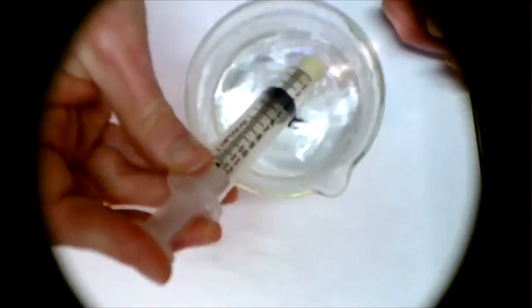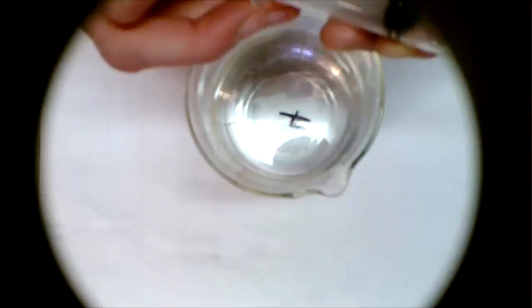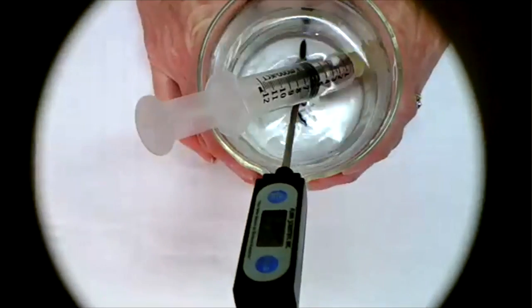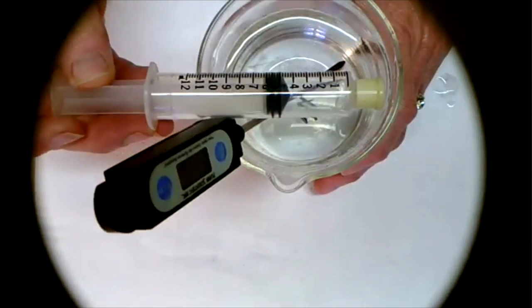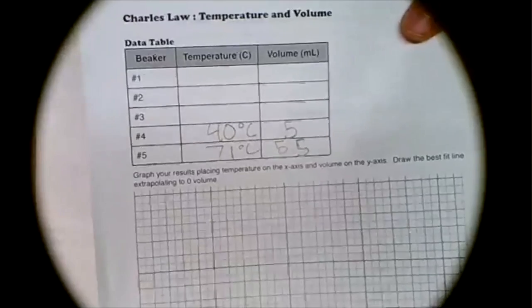Here's the second one. Again, I'm pushing on it only to release it from sticking. This is number 4. Yeah, hot tap. So we'll see what temperature it is. This one's 40 degrees Celsius, and it didn't change much. It's still at 5. So 5 milliliters for number 4.